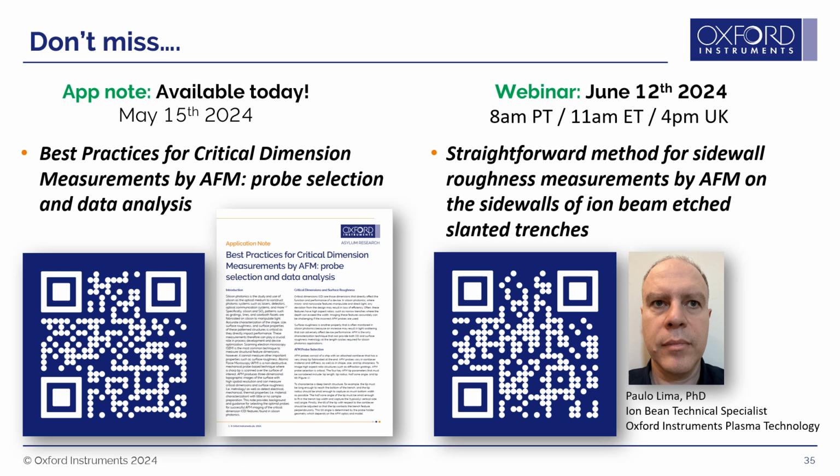We had a couple of discussions with our colleagues at our sister company, Plasma Technology, who provided the samples that we were imaging, and the differences that we're seeing are probably due to the fact that the distances may be underestimated in SEM measurements. Just because, as Ben was explaining, depending on how the SEM images are taken, from which angle, from which side, you can have a little bit of distortion, and then the measurements are made from the images that were acquired. So it's a little bit of a two-step process.